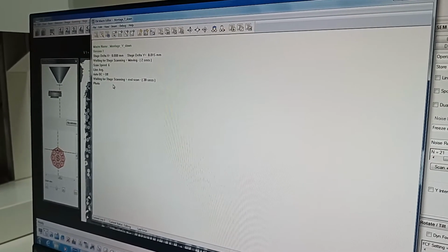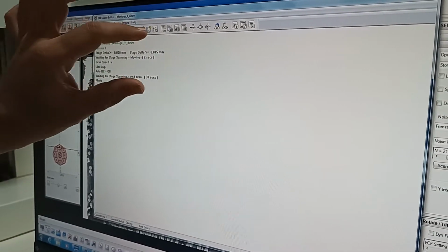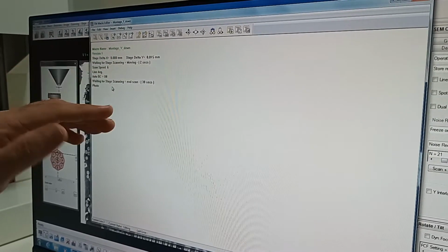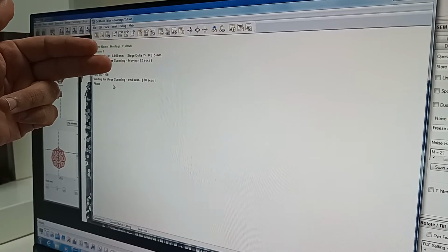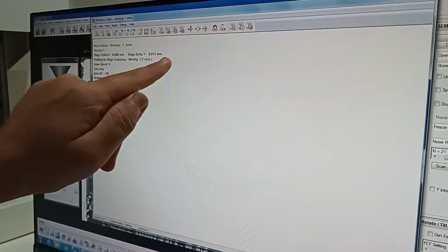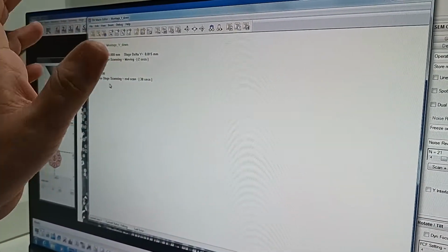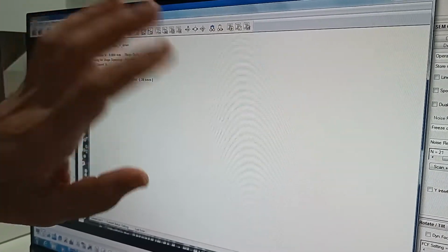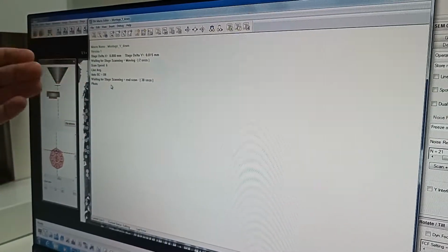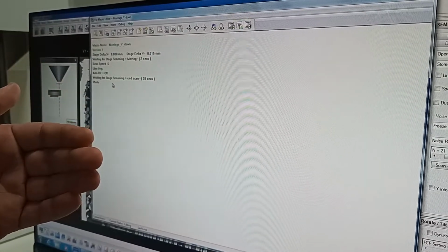And you might have noticed in the main macro that first we had taken this picture and taken the scan, and then we called this macro. We did not call the macro straightaway in the first command itself. Because if we call that macro in the first position itself, the first thing it will do is move down. It will not take the picture of whatever initial position you have kept. You can manually take that picture, that's another thing, and you can simply call this macro and tell it to go down or up or whatever position you like.